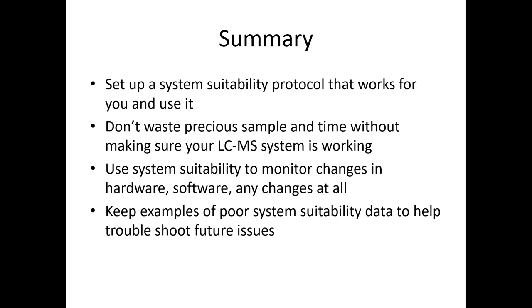Don't analyze your precious samples without having a system suitability in place, because ultimately your precious samples are going to generate data that will be used to make assumptions or conclusions or diagnoses. And if you are not sure of the quality of that data because the system might not be performing right, then there is absolutely no point in generating those data. So make sure your system's running fine so that the conclusions you can draw from those data are valid.